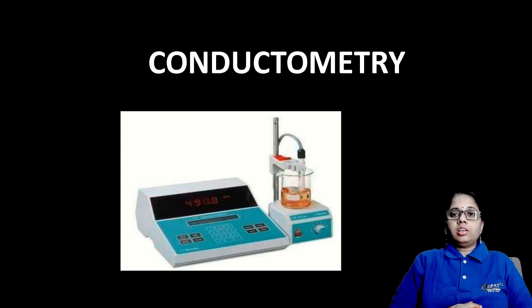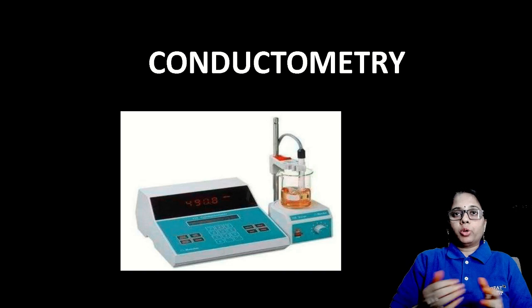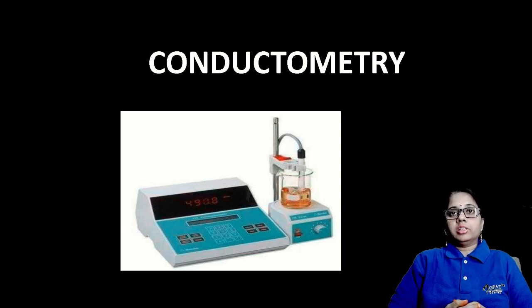If you see the picture related to conductometry in this slide, that is the auto titrator, which is going to be used for conducting the titrations. In conductometric titrations, so many models are already available. Auto titrators are available, and manually also you can perform the titration.